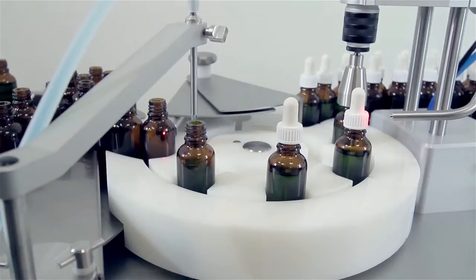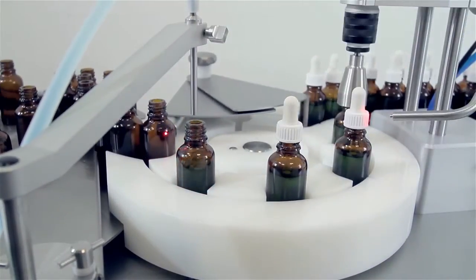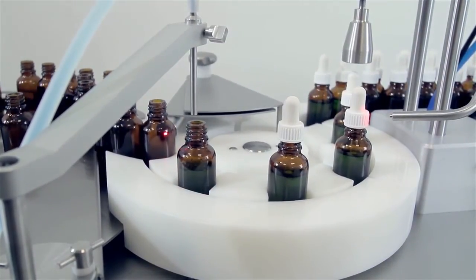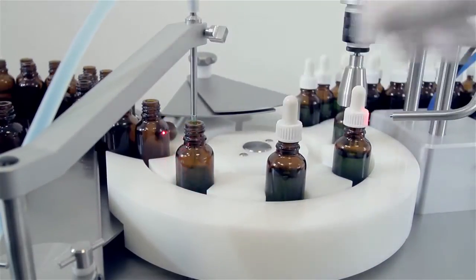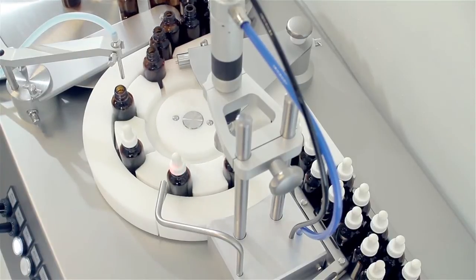The FlexFeed 30 meets the demands of flexible, small-batch production while delivering consistent production quality that is not possible with manual filling and capping. It delivers an excellent return on investment when upgrading from manual filling and capping solutions.